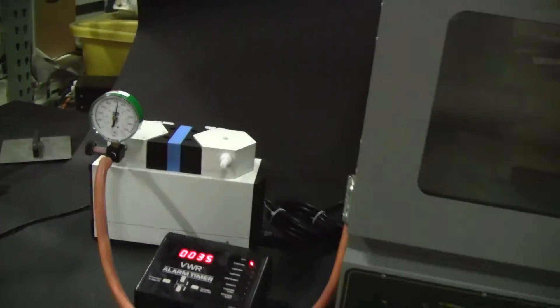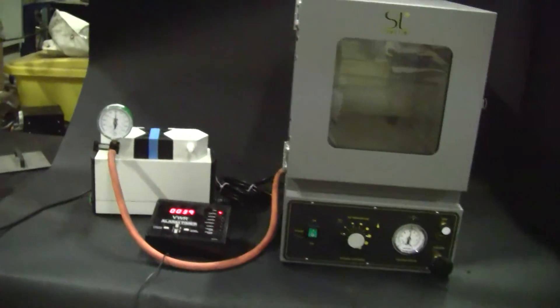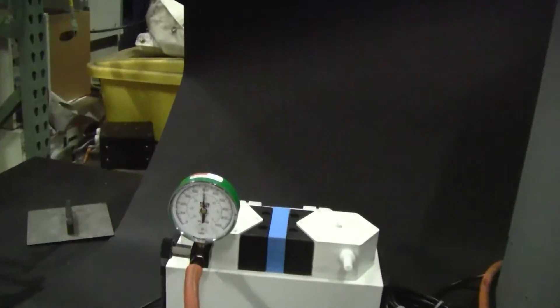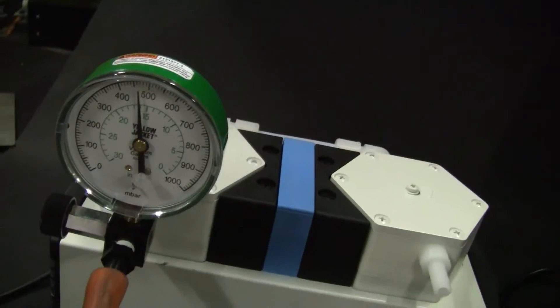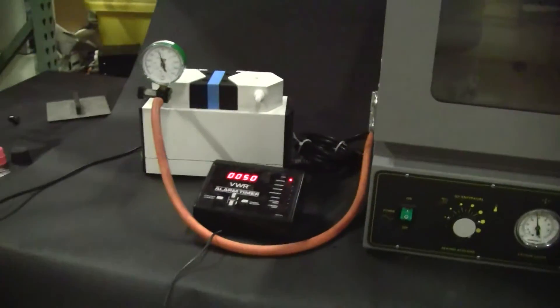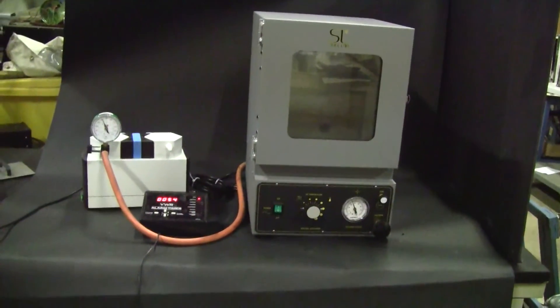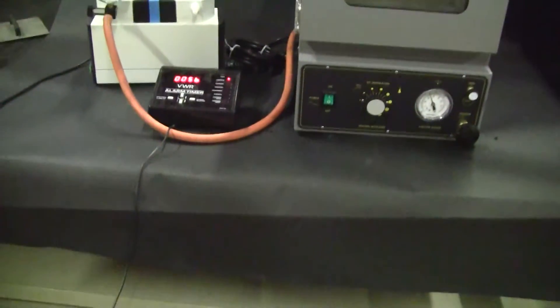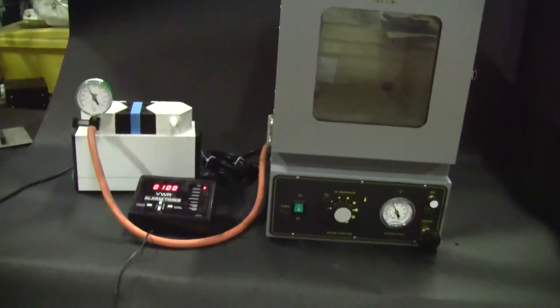It's a dual diaphragm pump, two stage pump. The gauge package is very nice with dual units of measurement on it, and a little gauge so you can control the vacuum to meter the vacuum level. We're just about at the one minute mark, which is showing some good progress.